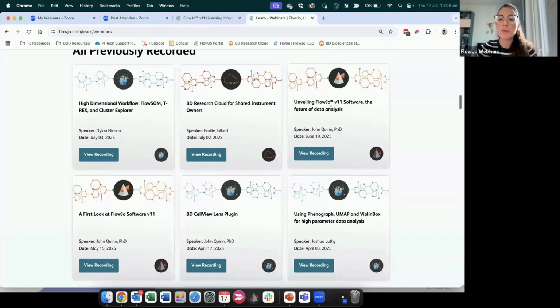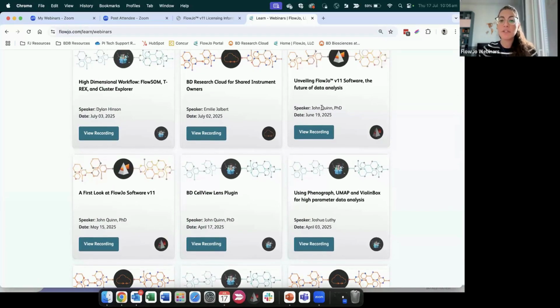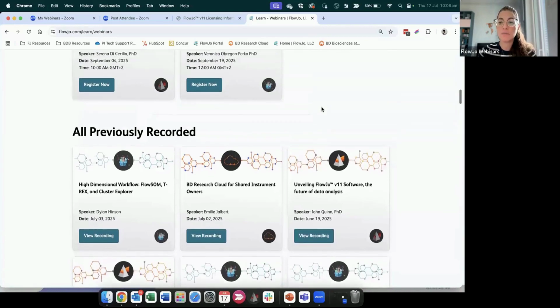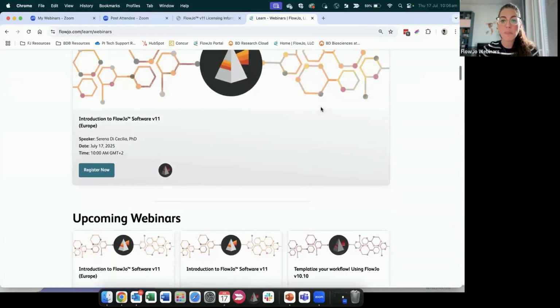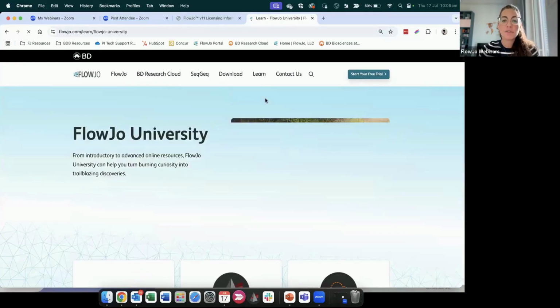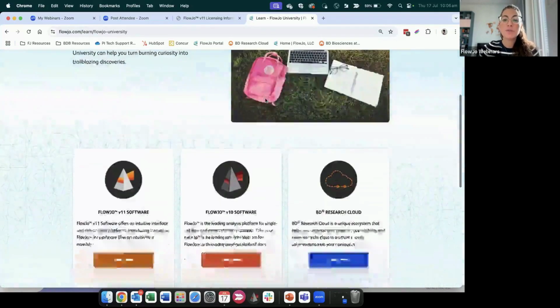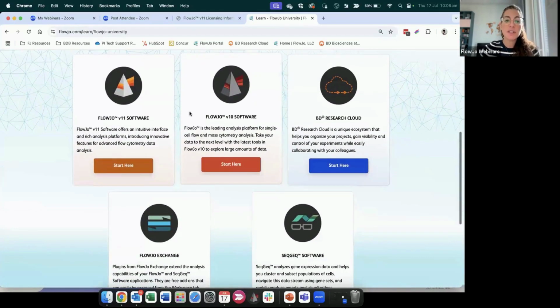You will find the 2 webinars about version 11 and the rest of the webinars that we keep having on advanced features of v10 and on BD Research Cloud. The same way, under the Learn button, you can find the FlowJo University. So I would strongly recommend, the moment that you download the software, that you check our videos on the installation.